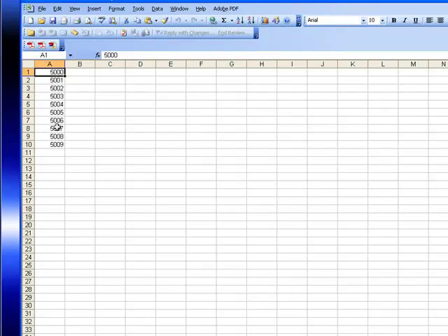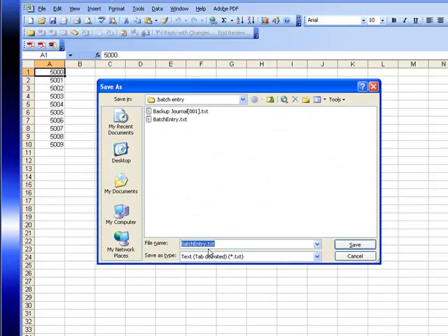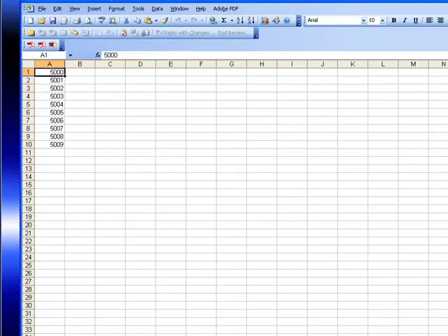So if you've got a list of numbers that you want to create samples by, you would go ahead and put them in a text file. You can read them in Excel, but make sure that if you do, you save it as a TXT tab delimited format. Don't save it as XLS. Freezerworks can't read the Excel format. It needs to read the standard ASCII text format, which is down here. So we've already done that. So let's go ahead and import these numbers and create samples for these.